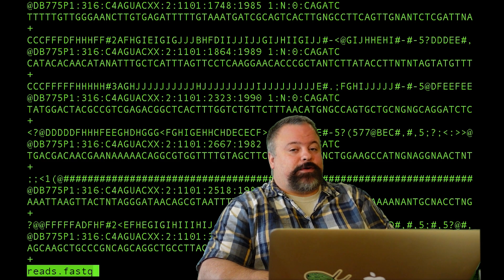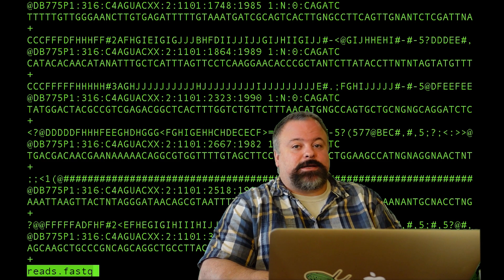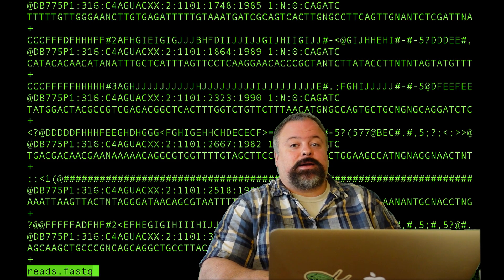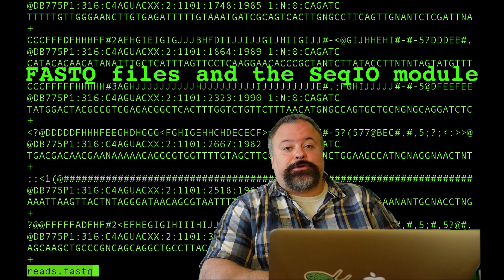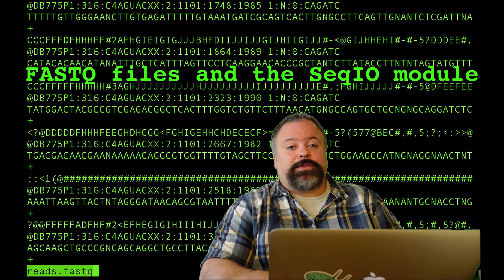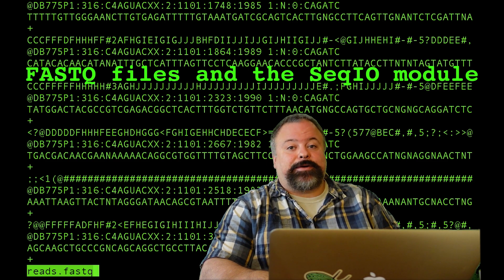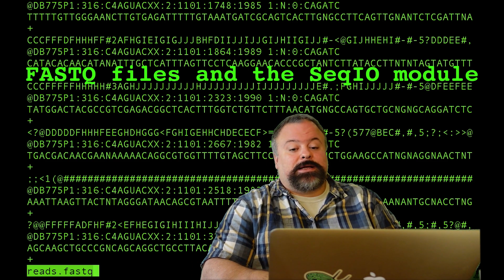Hey, welcome back. It's Professor Hendricks, and today I'd like to talk to you about how to process a FastQ file using the BioPython SeqIO module.